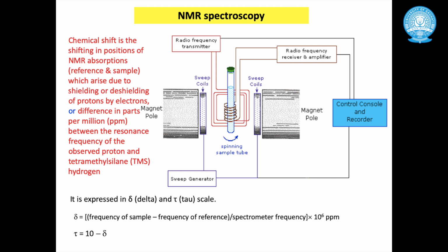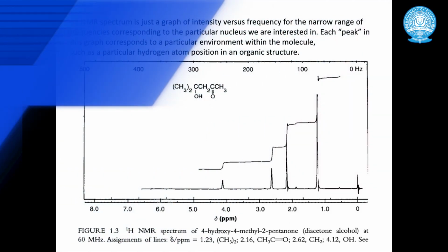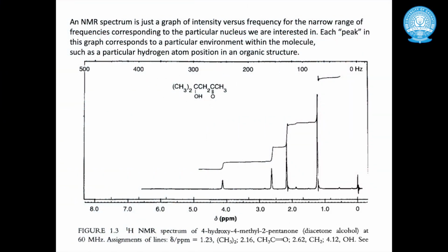So now if you go to the next slide where the NMR spectrum is shown, we will be able to confirm the structure of the compound.